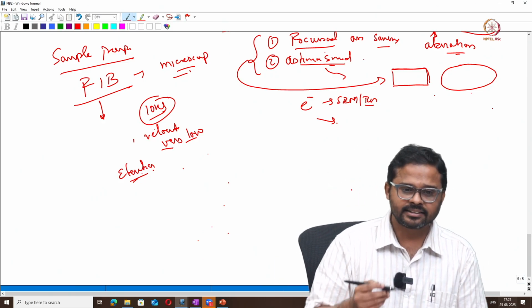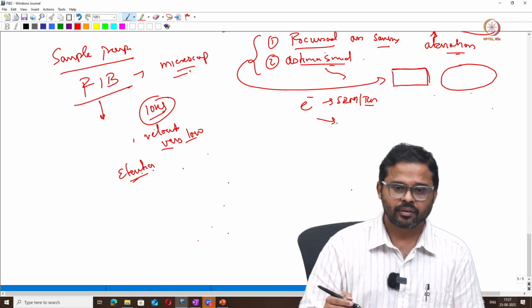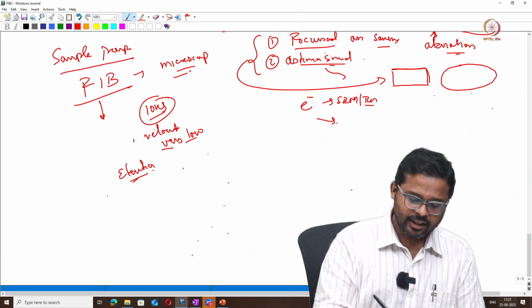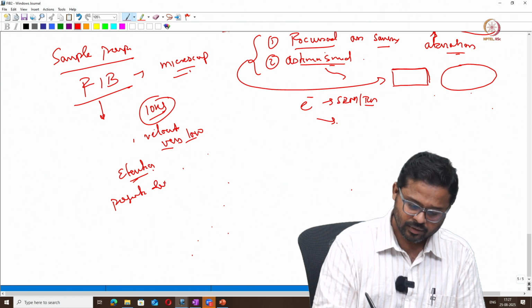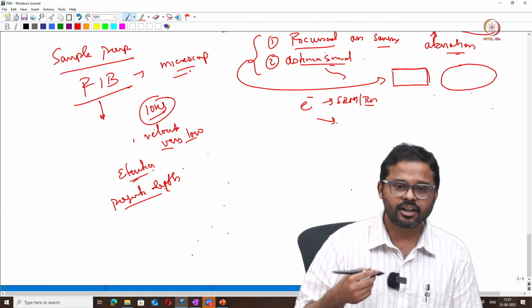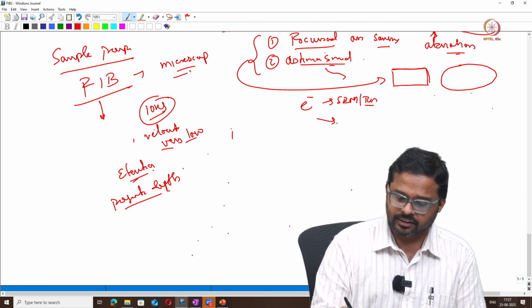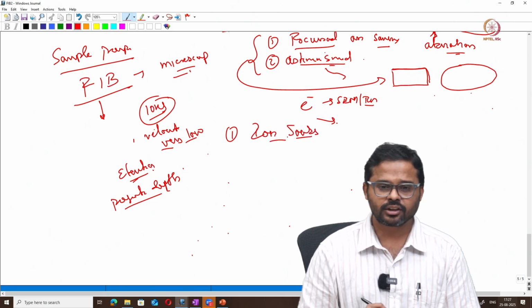So now these ions get accelerated, and they can be used for patterning and for the sputtering process. They have a certain projection depth, which is the distance the gallium ions travel inside the sample until they lose all their energy. We also talked about the ion source. So the ion source is only for the sputtering process.